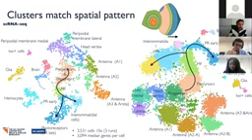And in the eye part, we find a trajectory from progenitors and precursors here, anterior to this furrow, over the morphogenetic furrow in green, and then more and more towards the right here, the posterior side, which are differentiating photoreceptor neurons. And the same is found on the ATAC-seq side, although here one of the antennal rings is split into 2, and the rest is agreeing very well.